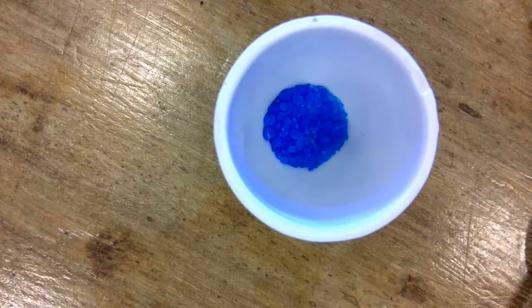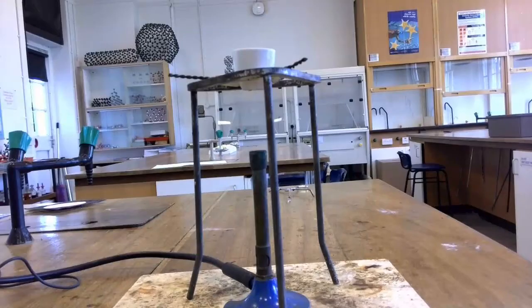Okay, so I have got my blue copper sulfate crystals and I've weighed out approximately 1 gram of them. I need to weigh this out accurately, but I don't need to have exactly 1 gram. So I've got 1.1 grams there and that's absolutely fine. And you can see they're a nice blue colour and they're a regular crystalline shape. I've now got my Bunsen burner, tripod and clay triangle set up. And I'm just going to gently heat my crystals in the crucible.